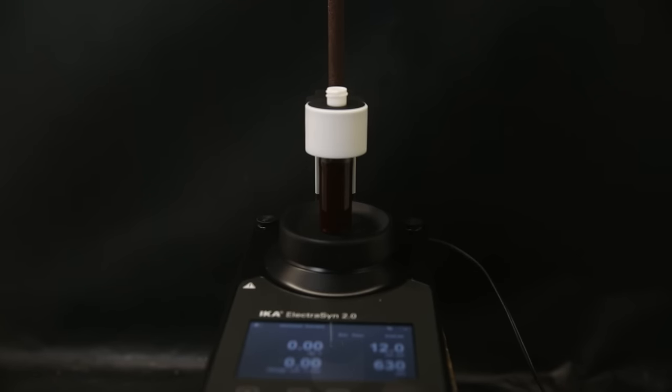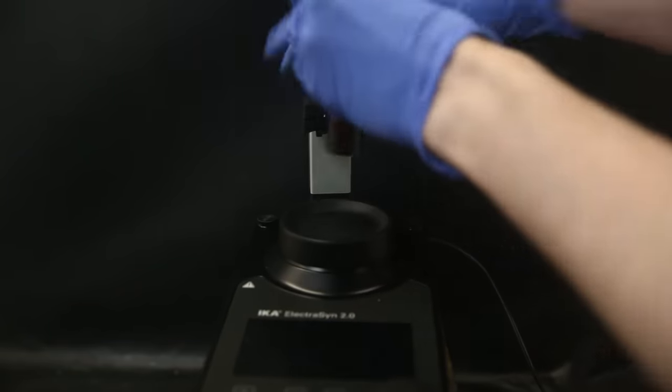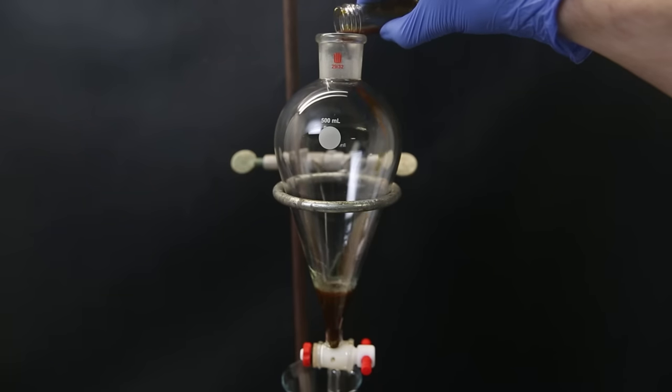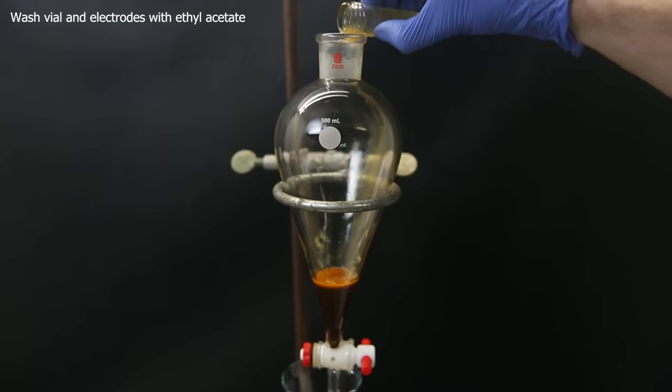When I return, the program is finished and it is now a cloudy brown suspension. So I turn off the device and remove the vial with the electrodes. I move all of the contents to a separatory funnel and wash the vial and electrodes with ethyl acetate and add that to the sep funnel as well.